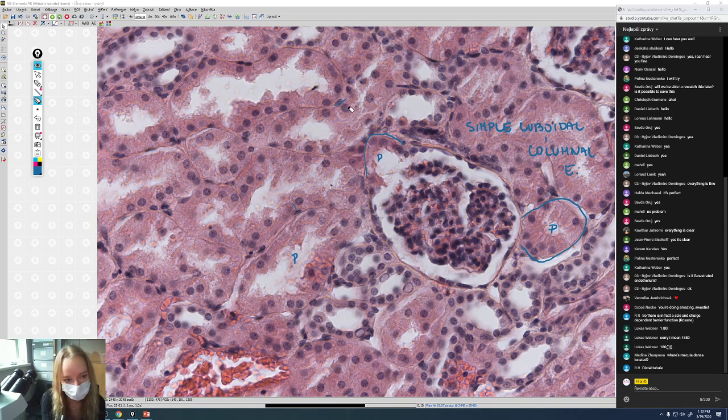cool. I like them. Because these cells are big. So sometimes these cells are 20 to 30 micrometers and have the nucleus in the middle of the cell.